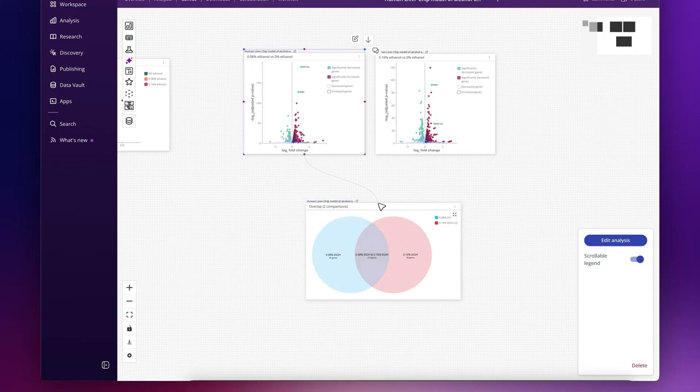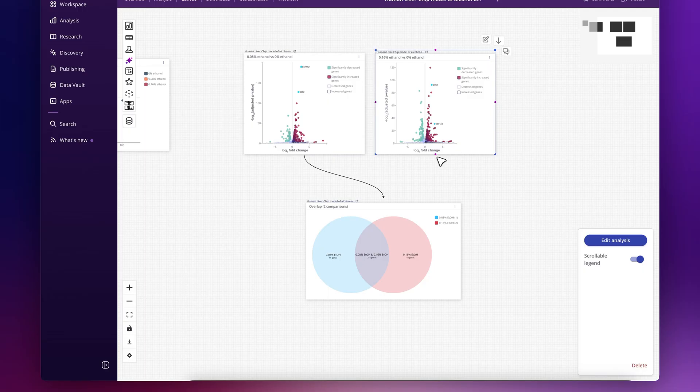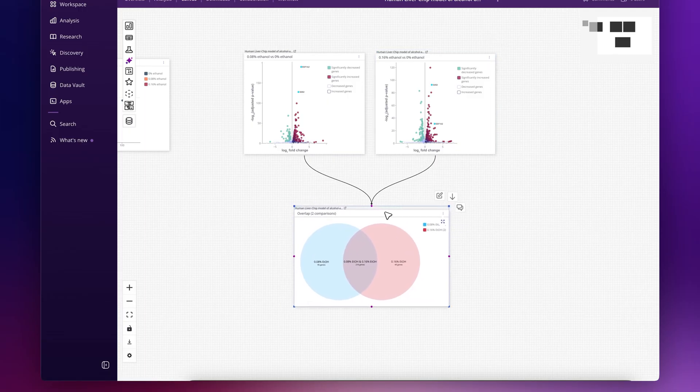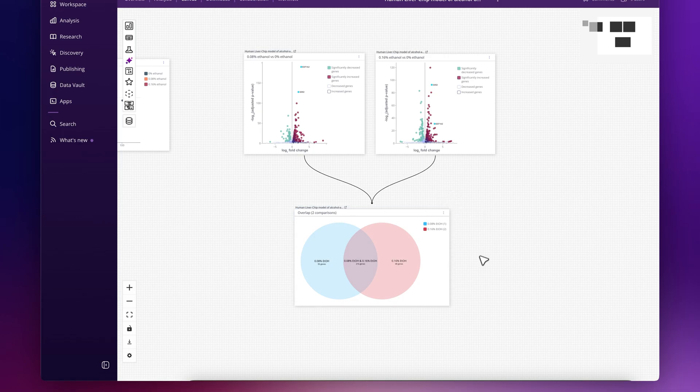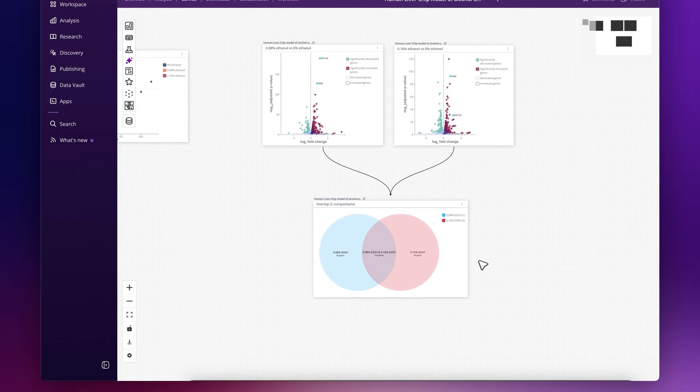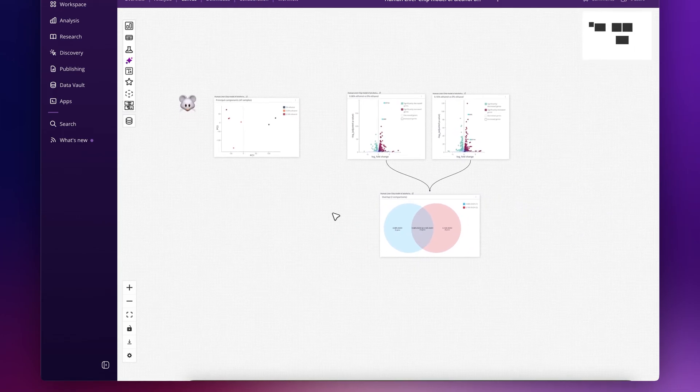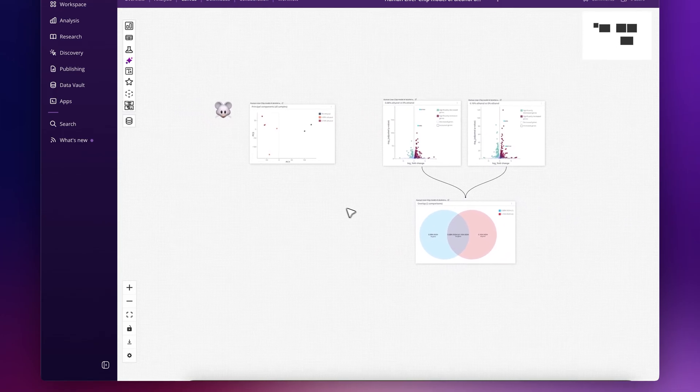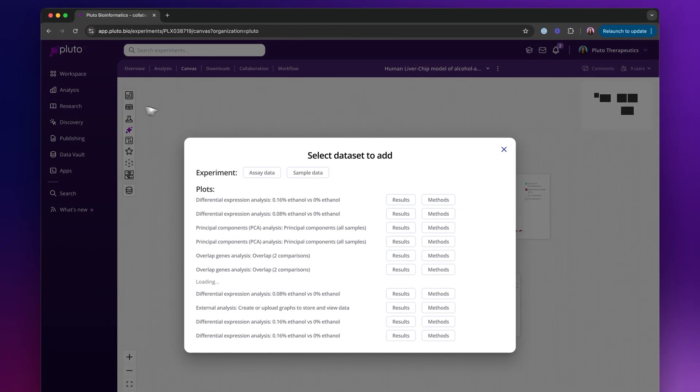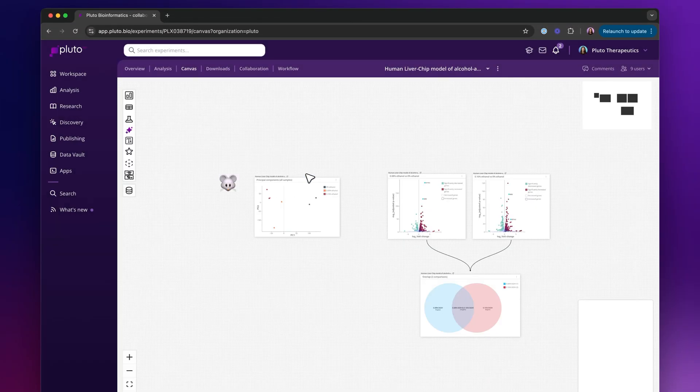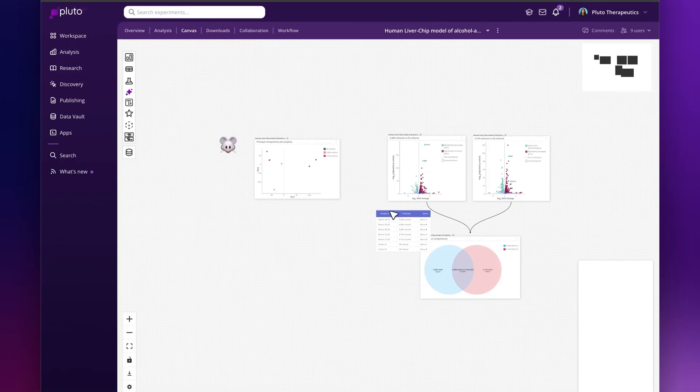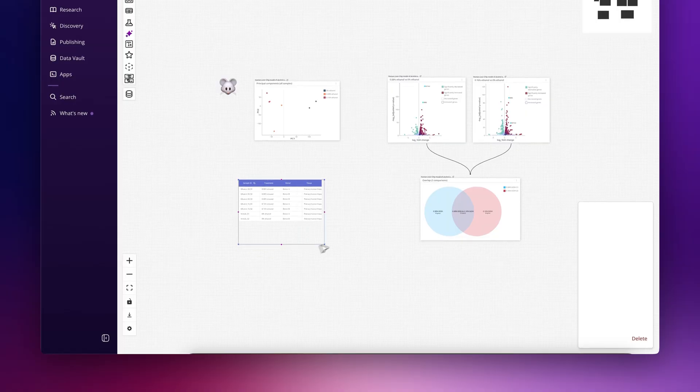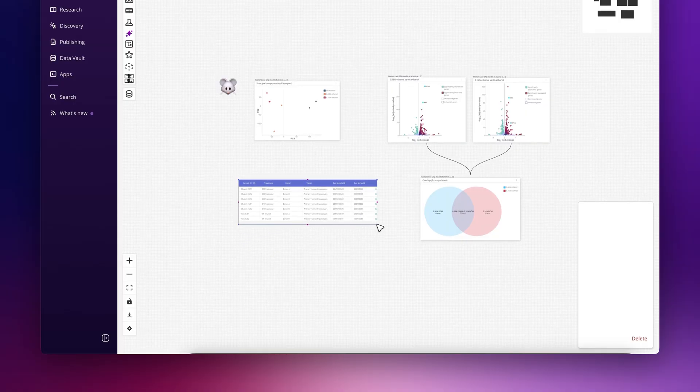And I can visually indicate where those had come from as well. Great, so this is how you would use Pluto's canvas to perform some analysis. These canvases are really powerful, can be used to display tables, results, methods, your own notes, and much more.